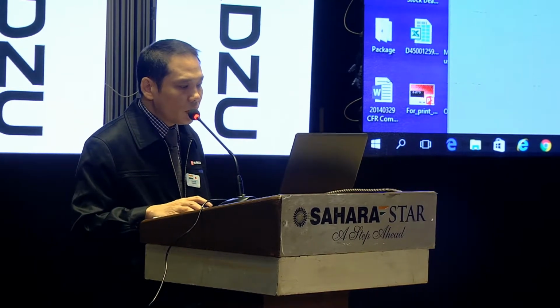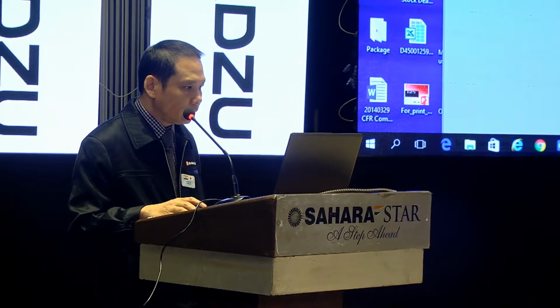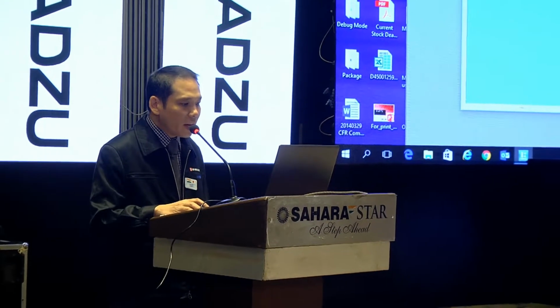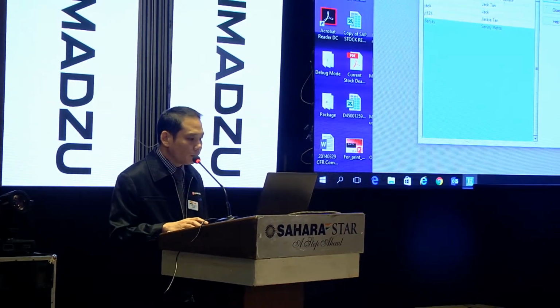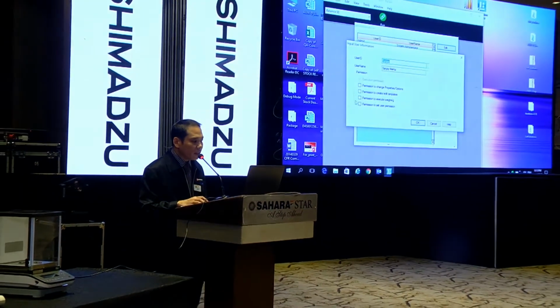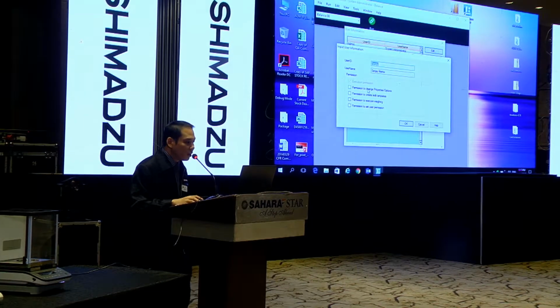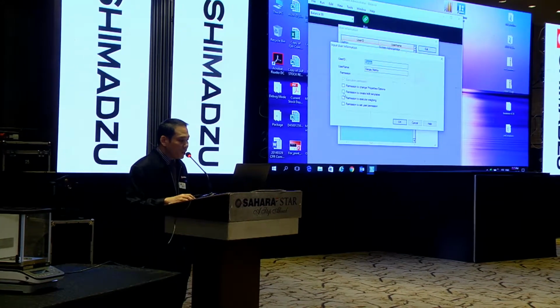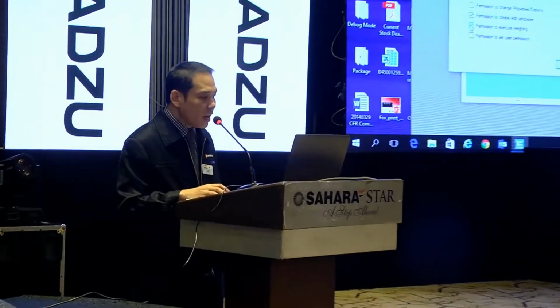So under user information, you can edit the user and set the permission that the user can use with the Lab Solution DB. For example, this user, I will just permit him to create templates and also permit him to execute weigh.